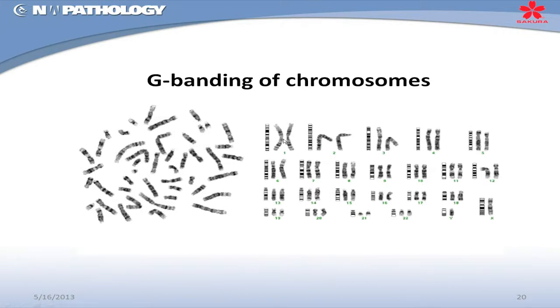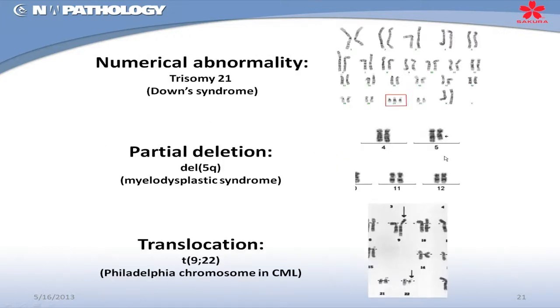And we don't have to go over them in detail, but basically it's very well known what the characteristic pattern is, kind of like a barcode of each chromosome. So once the Giemsa is put on there and the chromosomes are separated and analyzed, we can tell exactly which chromosome is which, how many of each one there is, and whether there are any major abnormalities in their structure. And here are some of the abnormalities that we could detect when doing this.